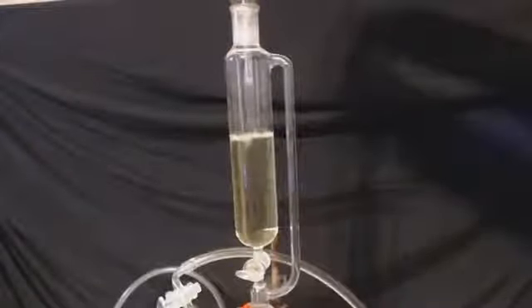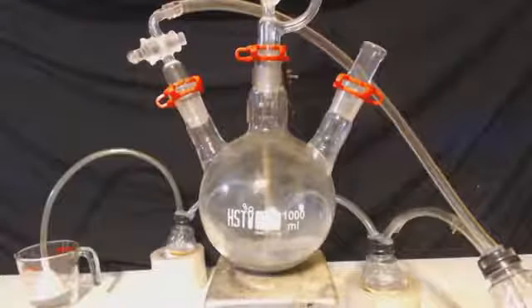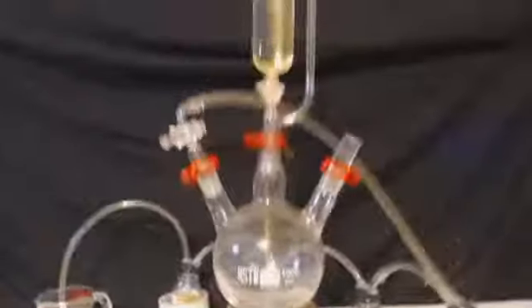And when I drip this in, I want to drip it in very slow. This stuff is going to produce hydrogen, and I don't know if you've ever seen the volcano experiment where they do the baking soda and vinegar, and then they mix it, and all this stuff comes out of the volcano. Or if you open a can of pop, Coke, and you shook it up beforehand, all that CO2 is trying to get out, and it makes that effervescence. Basically, that's what will happen here. So I want to drip it in nice and slow.